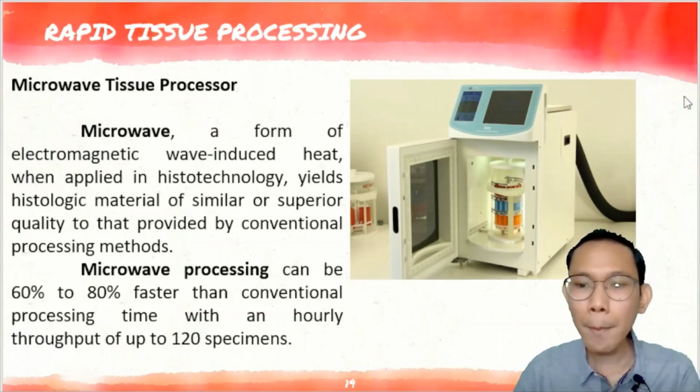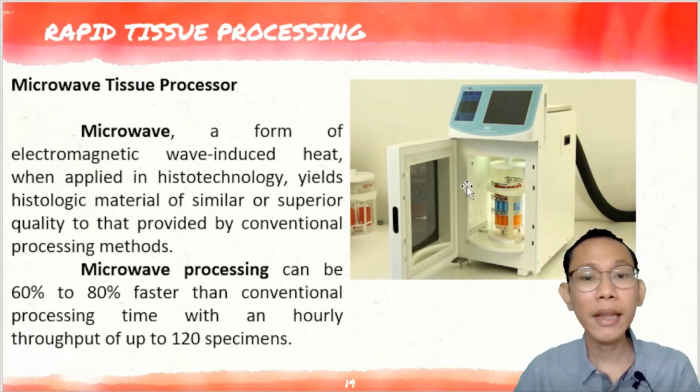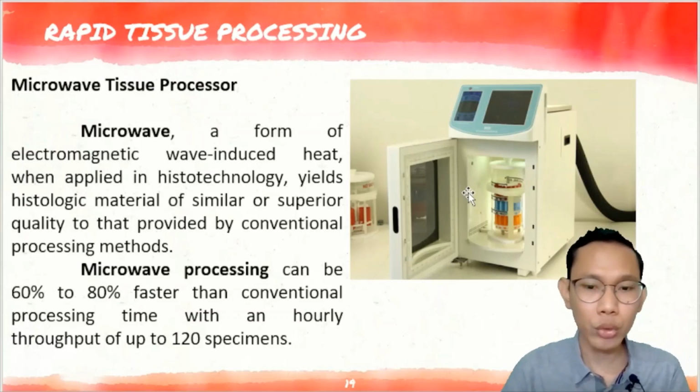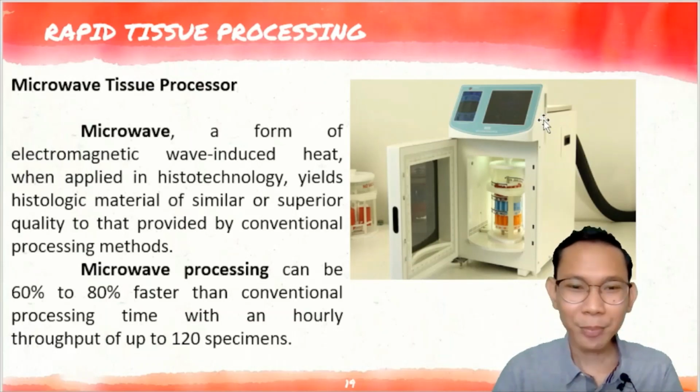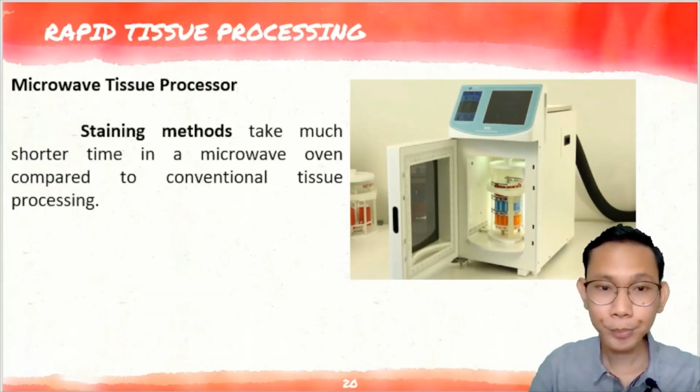So this is a kitchen type microwave oven whose temperature and output power are not precisely specified, leading to possible overheating and miscalculation of your percentage output power. So, this is really its only disadvantage, because we need very precise maintenance of temperature, which is very difficult to do, right?